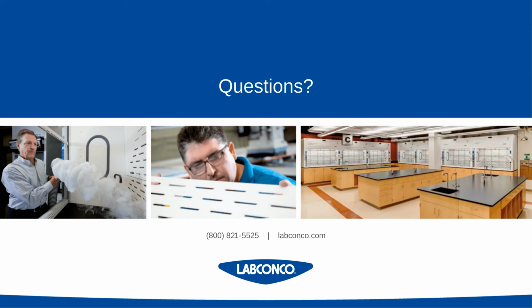there's a potential that it wouldn't necessarily make sense having high-performance fume hoods, but having fume hoods that operate at lower face velocities, because you're going to need to exhaust a bunch of air anyway. Especially when thinking about a VAV system where you're needing more air changes per hour when the hoods are not in use. So it's more about what you're going to operate the hood at, and if you have energy savings available based on the numbers associated with your air changes per hour.